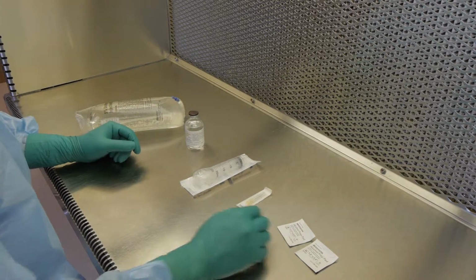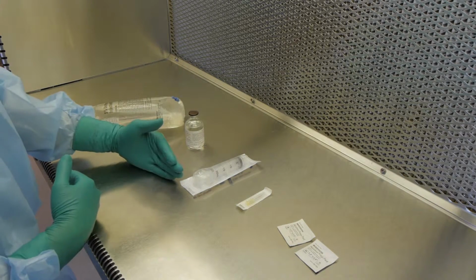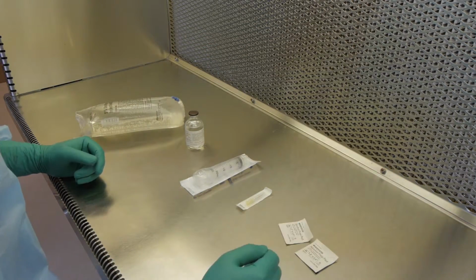When setting up your working space, it is important to place all items at least 6 inches inside the hood and at least 6 inches away from the back filter. This ensures that the clean airflow is consistent throughout.